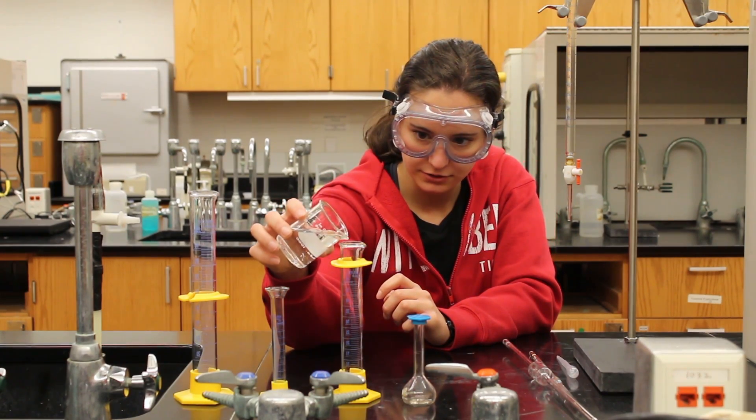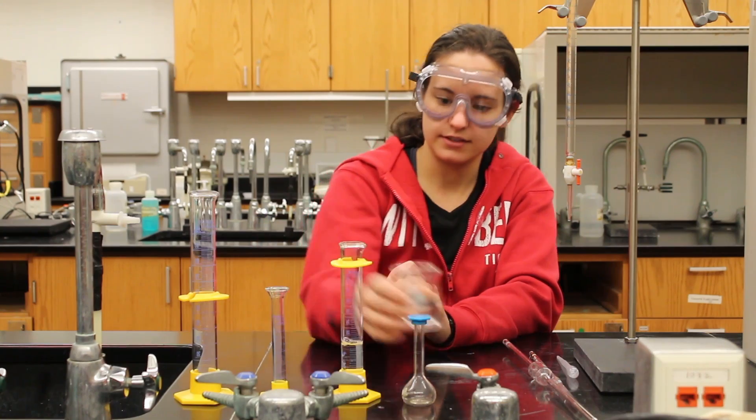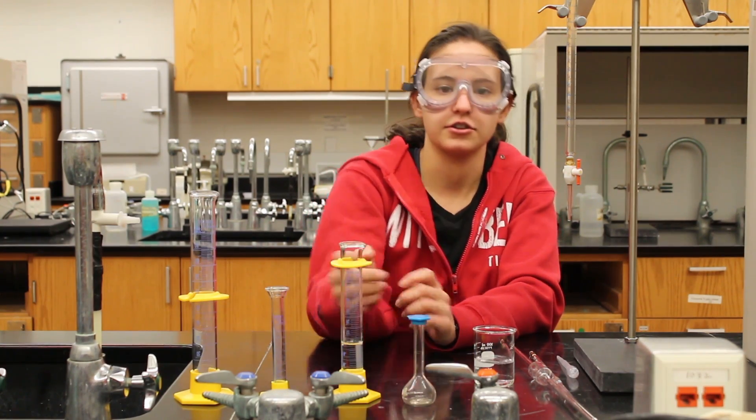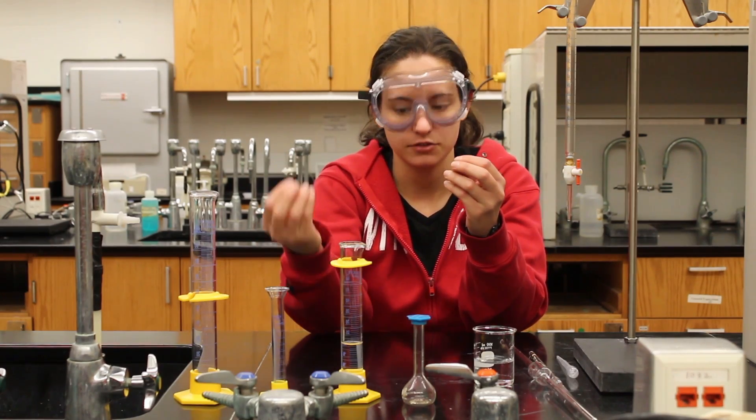As you'll see, while I pour the water into the graduated cylinder, the water will attract itself to the lining of the cylinder. That is due to adhesion, which is the molecules of the water attracting to the glass surface.